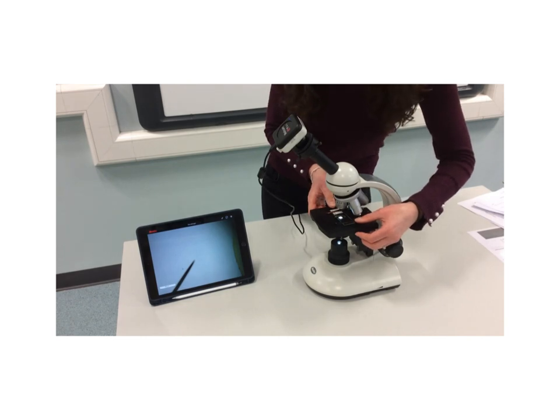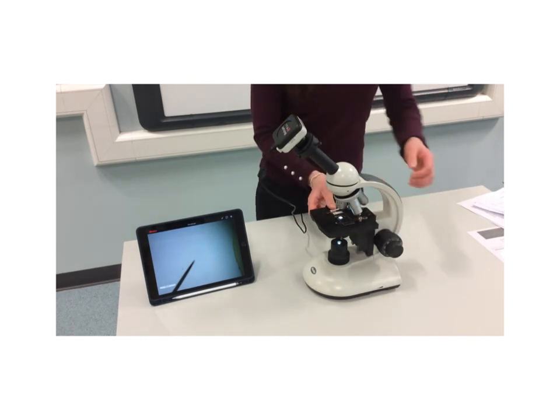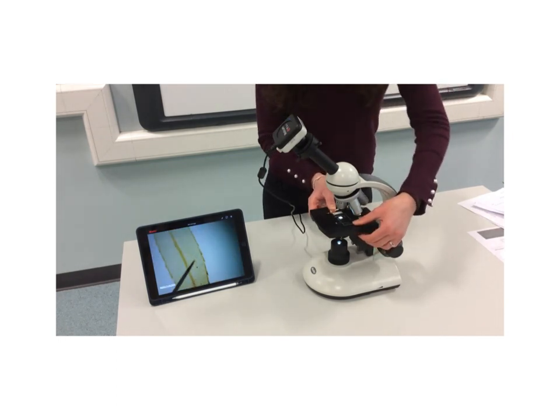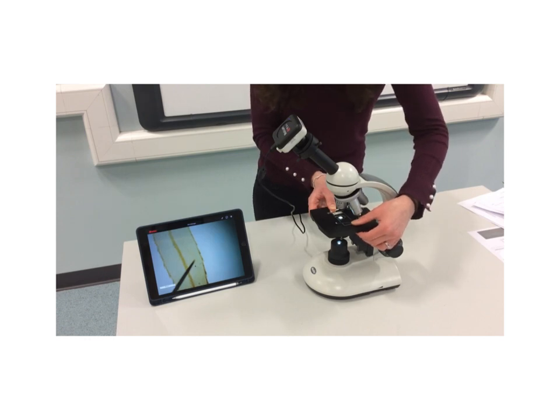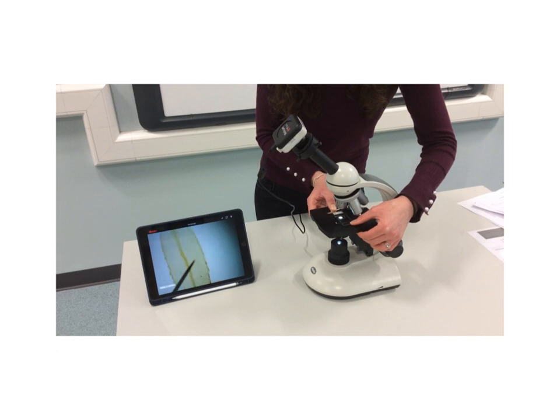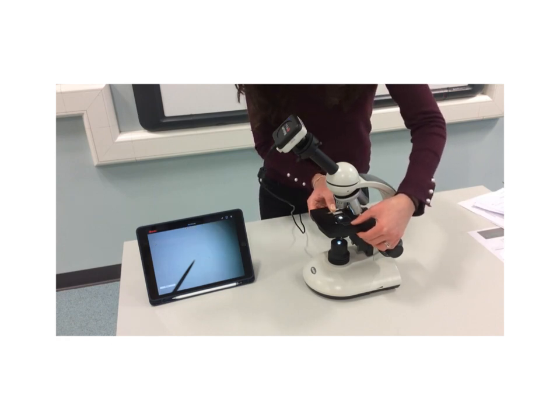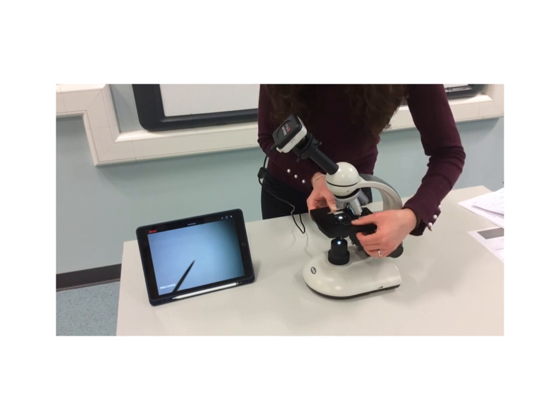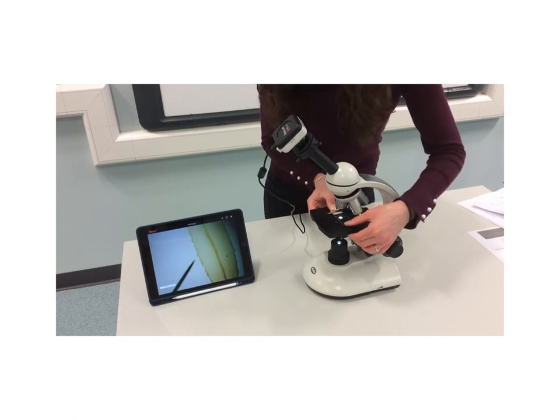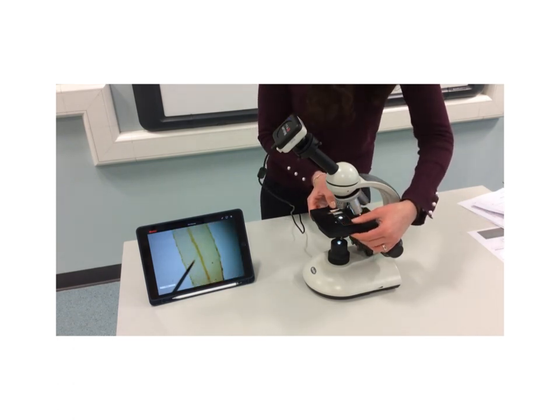Let's have a look now at what happens when we move it up, or we'll get the leaf back in the image. When we move it up, can you see that it moves down? And when I'm moving the slide down, what's happening? The image is moving up. Let me do that very quickly again. Let me get it kind of in the center again. Where's it gone? Okay, there it is.